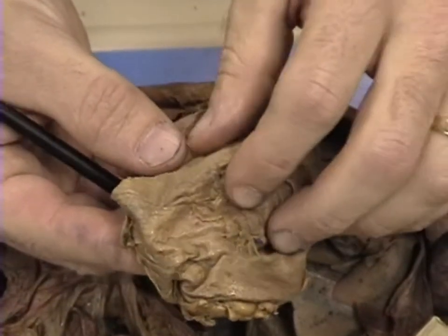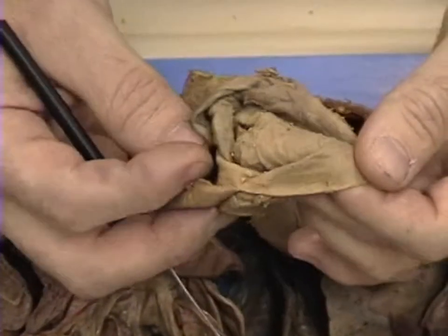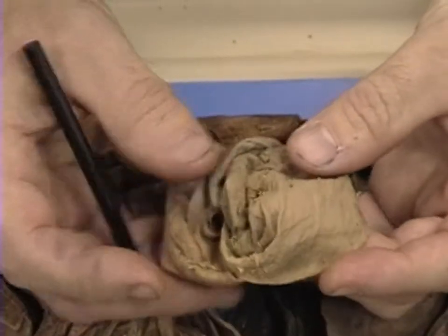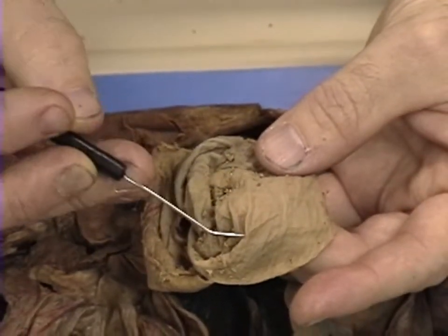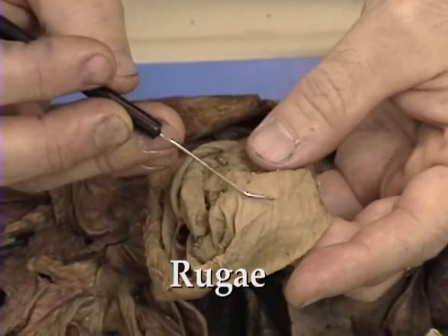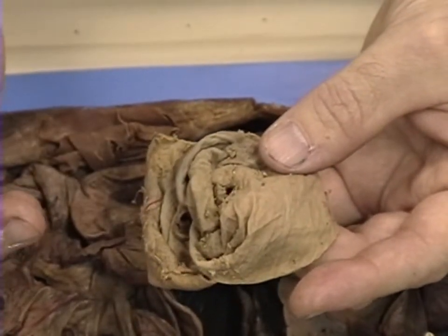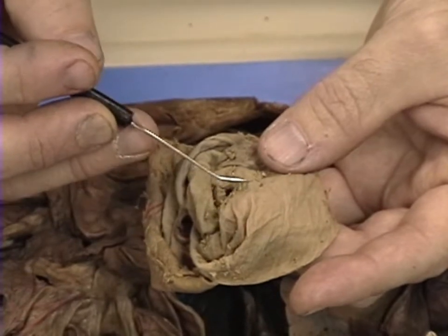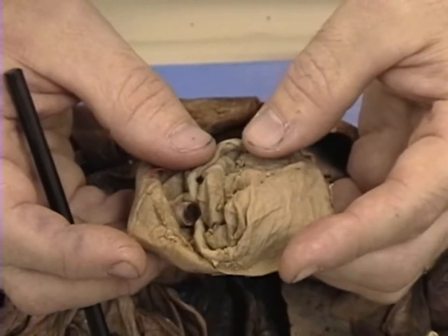If we open up the stomach of the cat, we can see several things. One is we can see several ridges, like this one right here, which are called rugae. These ridges are used to help churn the food in the stomach.